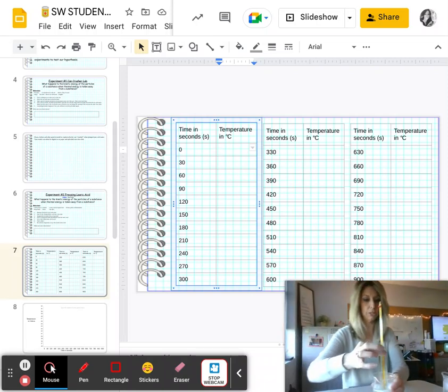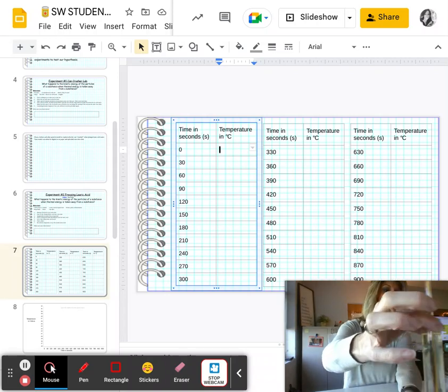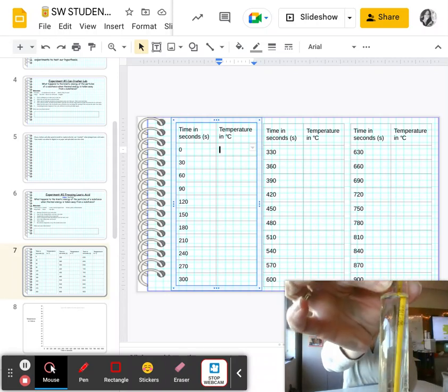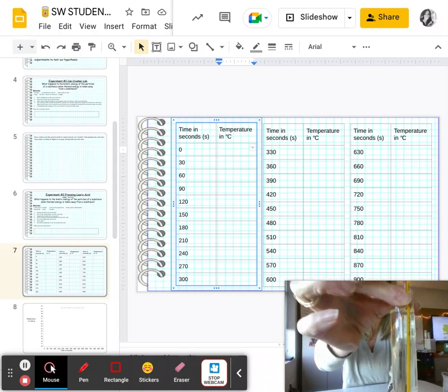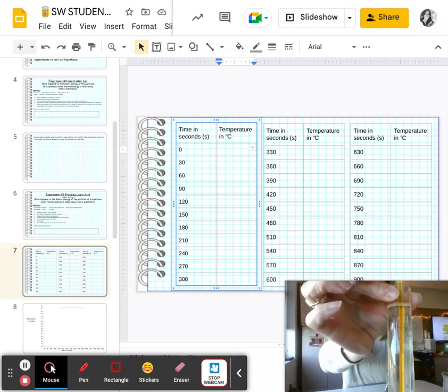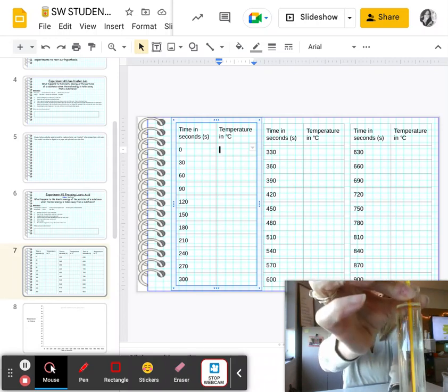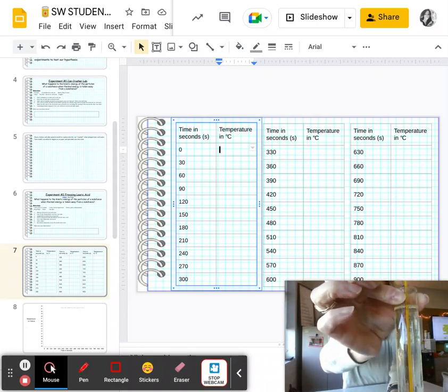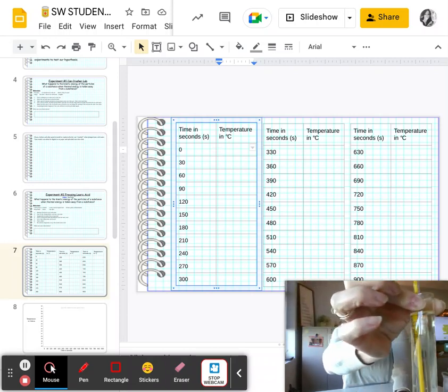So I have here some lauric acid. What I'm going to do is try to bring this a little bit closer to the camera, and I want you to observe what that looks like. Okay, you can see it's very clear. It's got a very faint yellow tint to it. I do have a thermometer in there, but you can see it's pretty transparent, right?